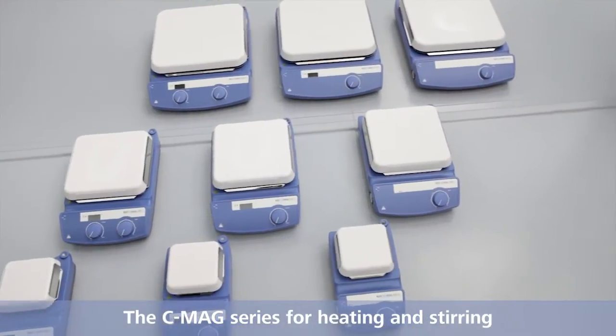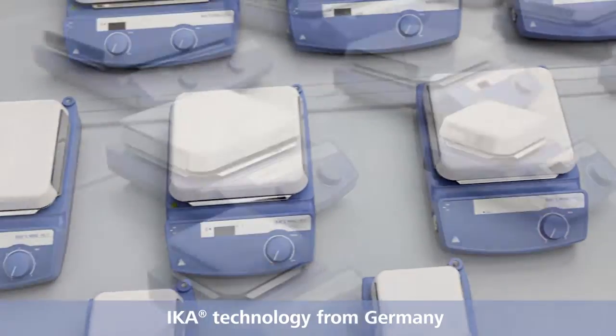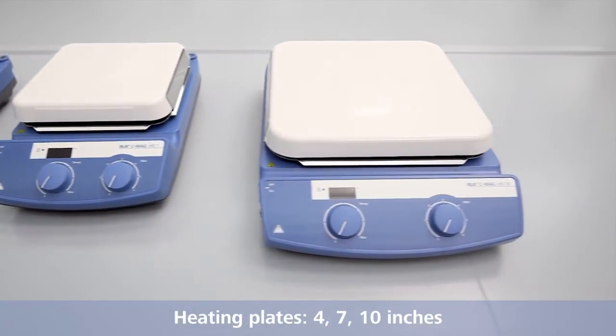The C-MAX series for heating and stirring. IKA, technology from Germany. All devices are available with heating plates of 4, 7 and 10 inches.